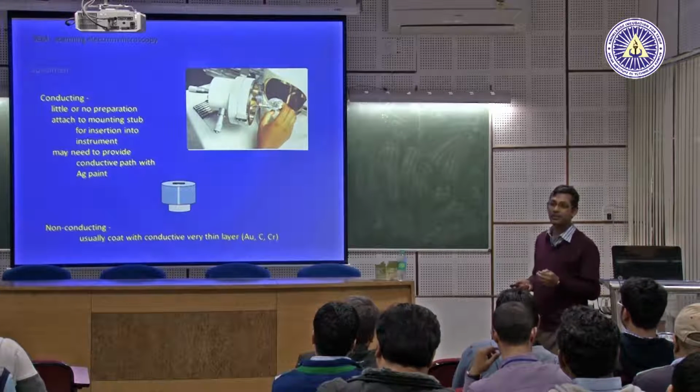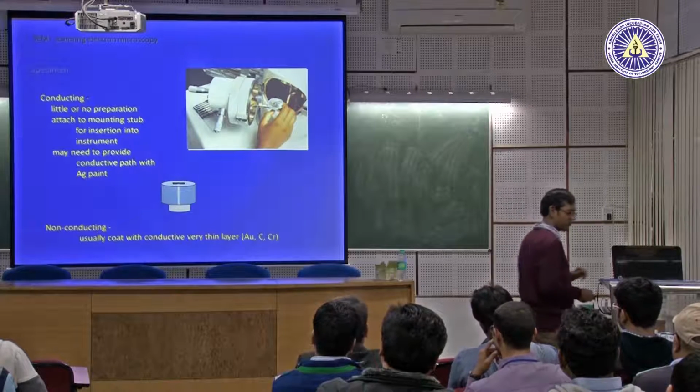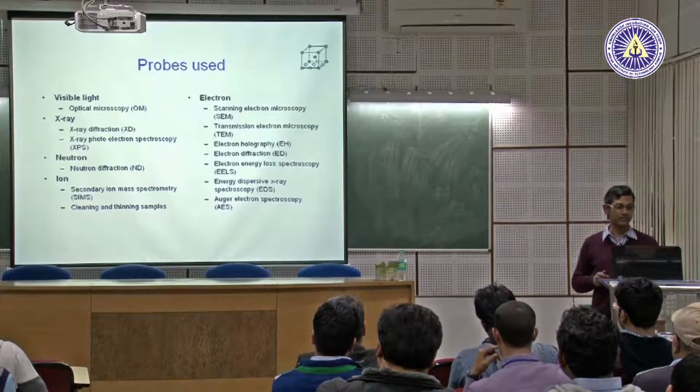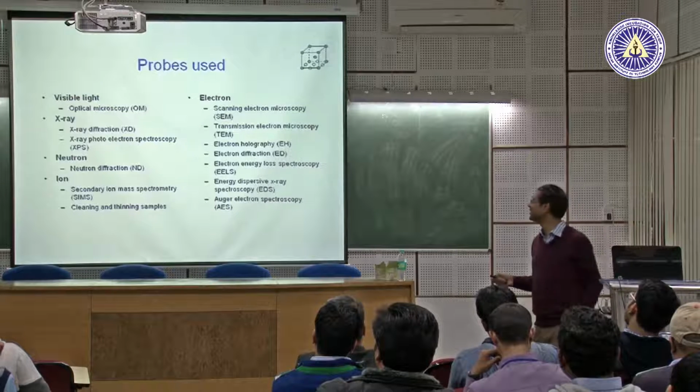Okay, it's a gold palladium alloy. So you should use a very expensive one, because it forms a continuous layer on the surface. Okay, now let us compare. You have seen this, right?